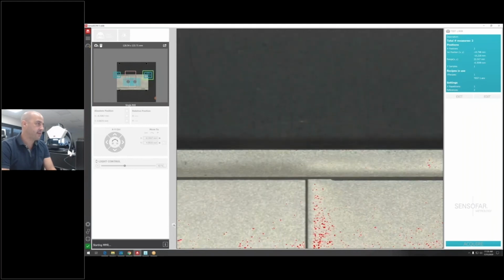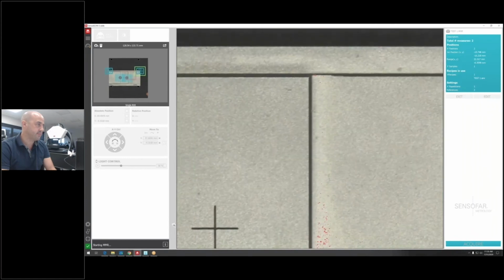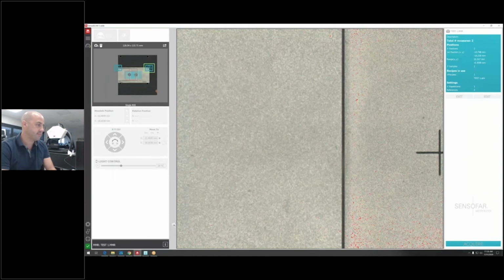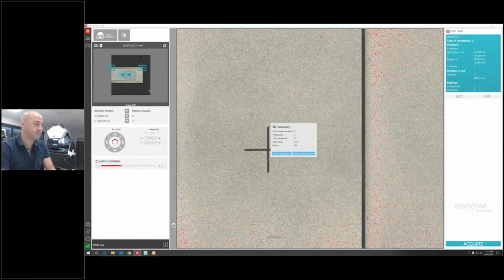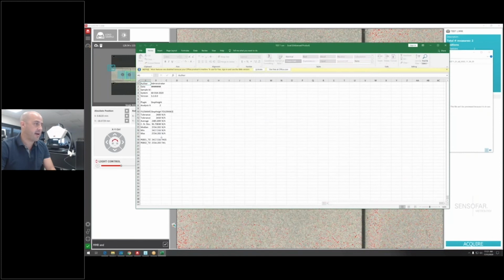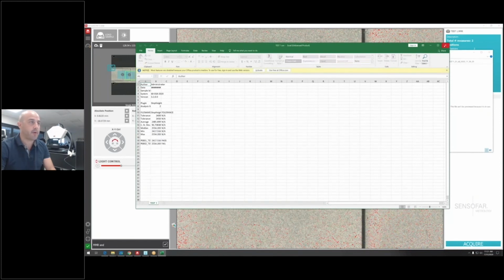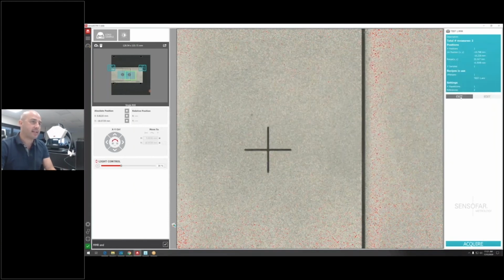Just moving to the first one. Taking the first topography, and now the second topography. Doing the analysis. Okay, and now you can explore the measurements. You can open the file, and here you have pass and fail, who was in, who was out. All right. So you say, okay, that's very simple. It's a step height. But what about more complex analysis, right?